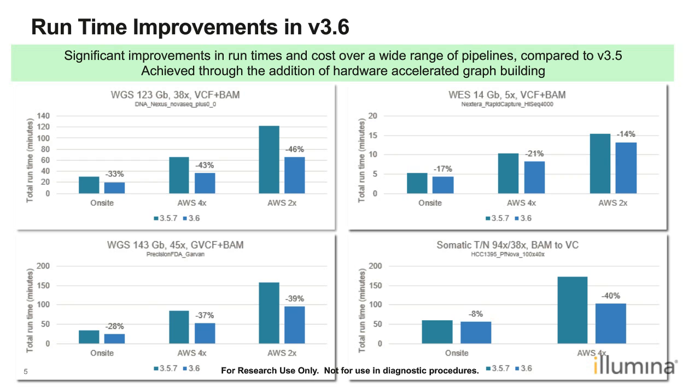The on-site is not, as I said, CPU limited, and we are running 2 genomes for a tumor normal, as you can see here. But again, going to the cloud for these deep sequenced data, which is at 100x, about 40x, you can see that the increase is very, very large. So overall, really a big update for us.